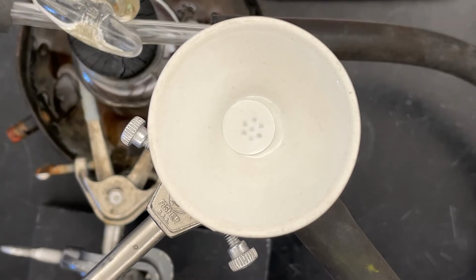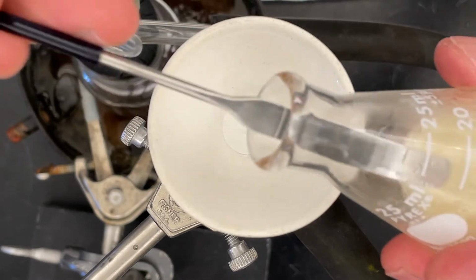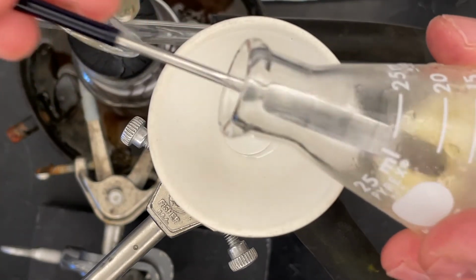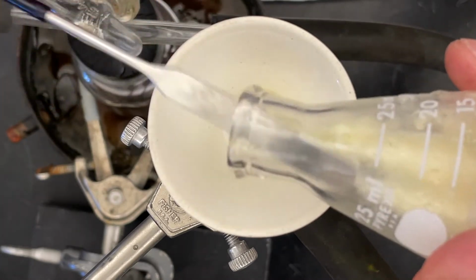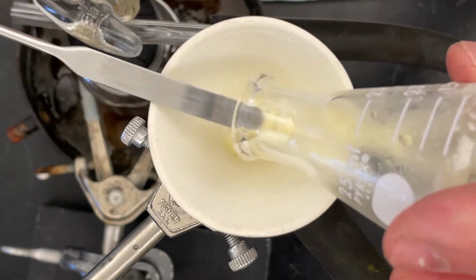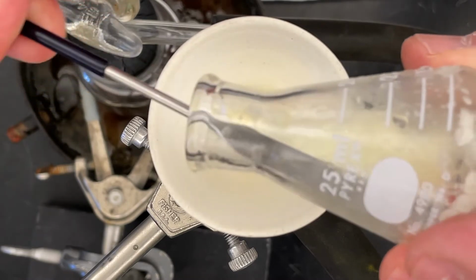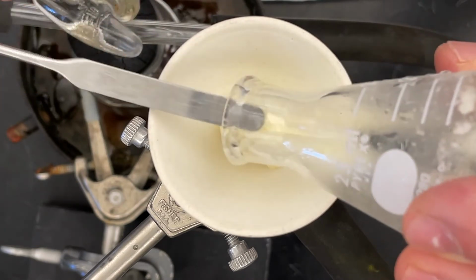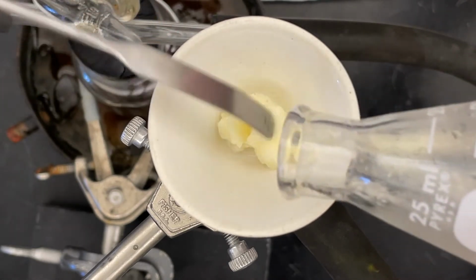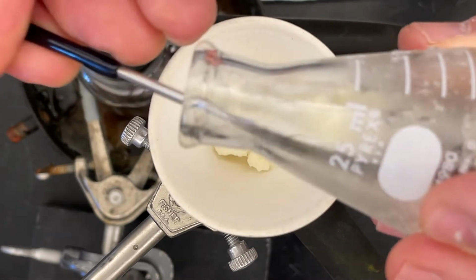We'll take our benzoin material, loosen it up a little bit. We'll use a curved spatula to try to take it out on one side. The benzoin is pretty thick inside this. There's not a whole lot of liquid in order to be able to pour it, so it really does take quite a bit of scraping to make sure that we get the material out.